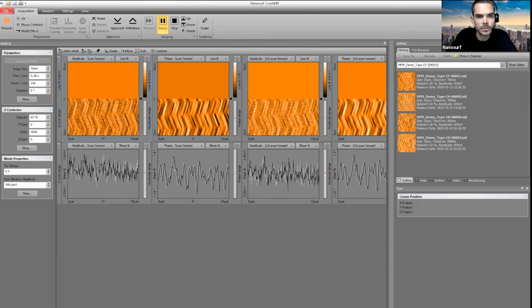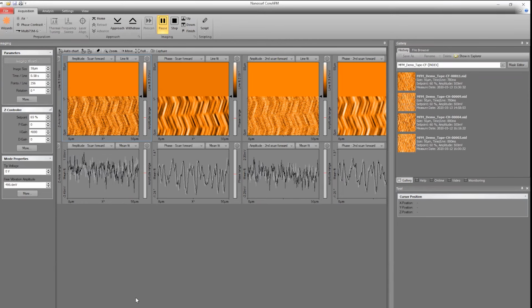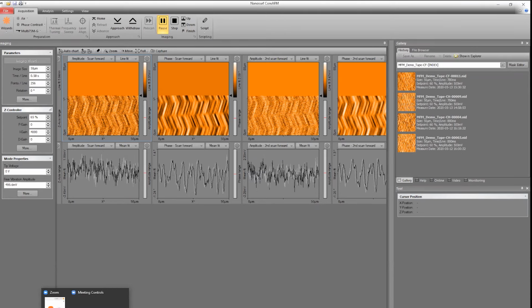I have a sample that changes magnetization upon application of an external field. Can you do that with your AFM? It's not a part of this tutorial, but we have an external field magnetic holder. It's an extra product, so you have to buy an additional holder. Let me show you. We'll try to show you a video of it.